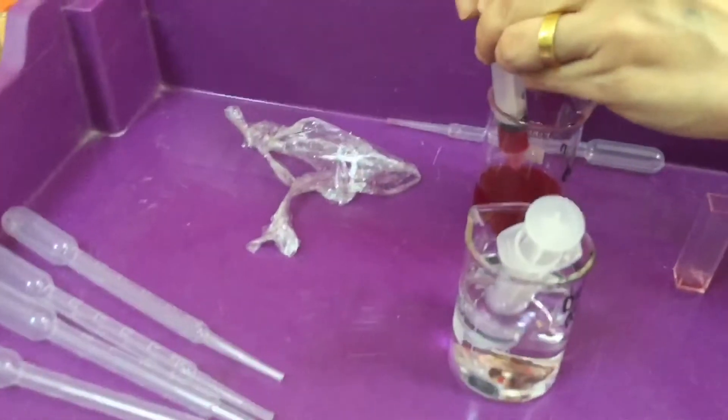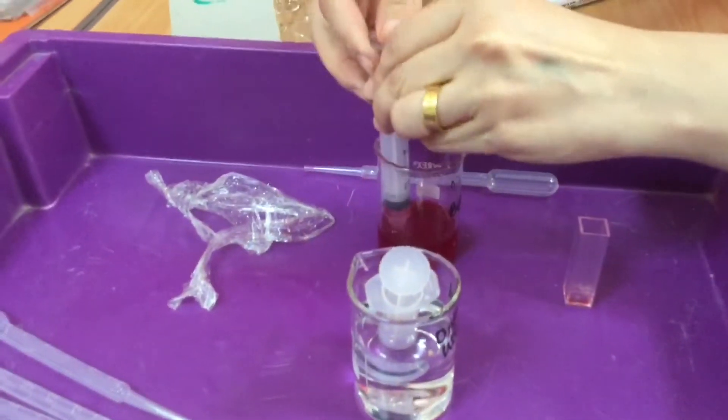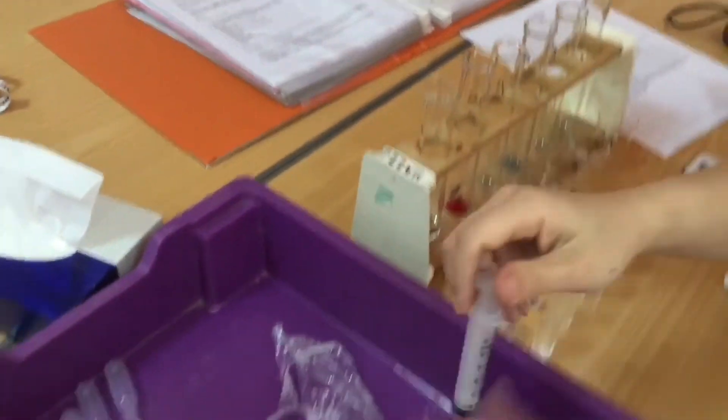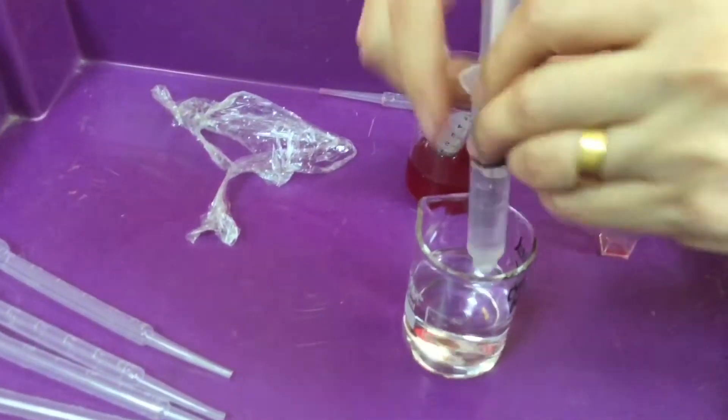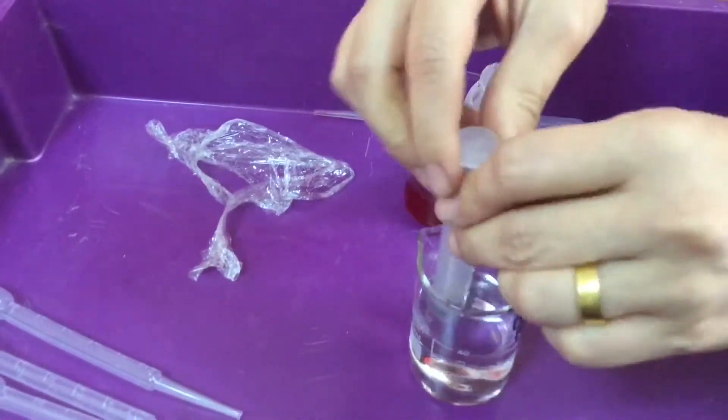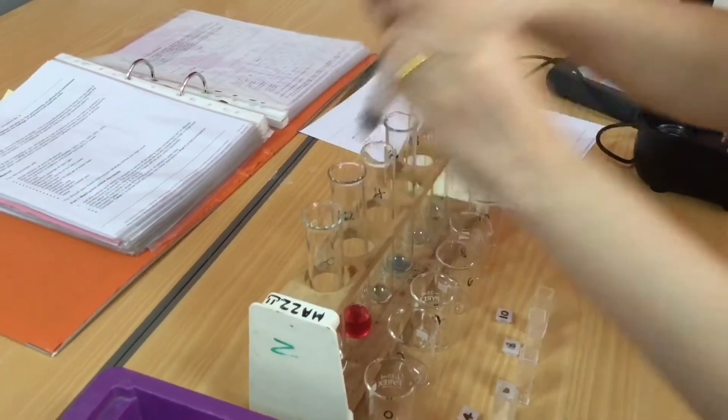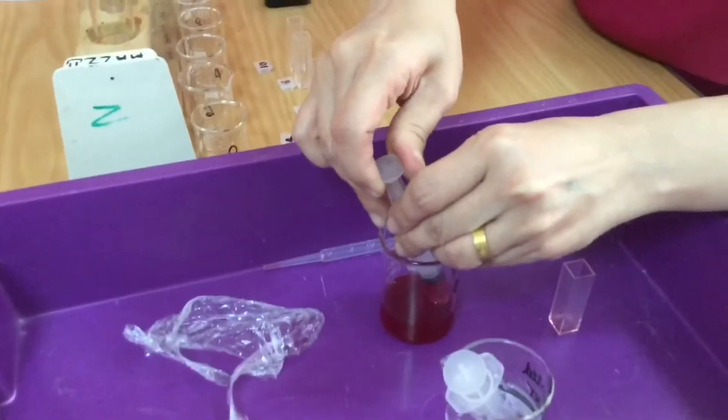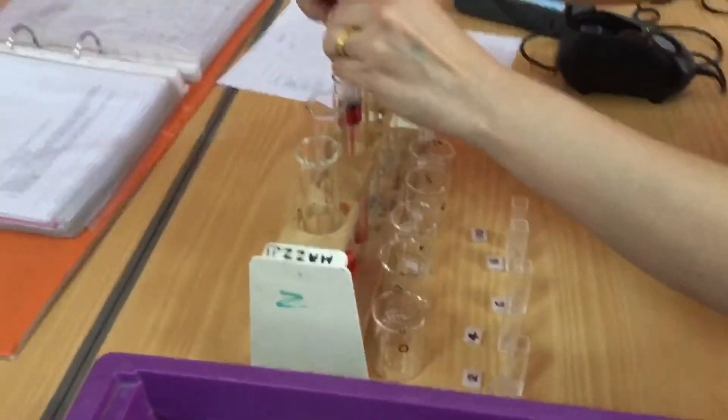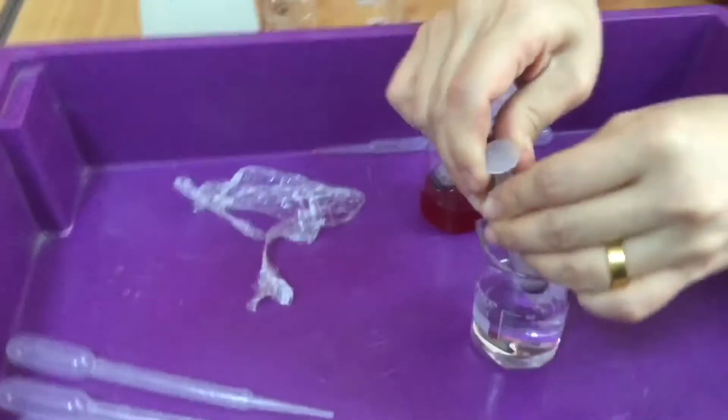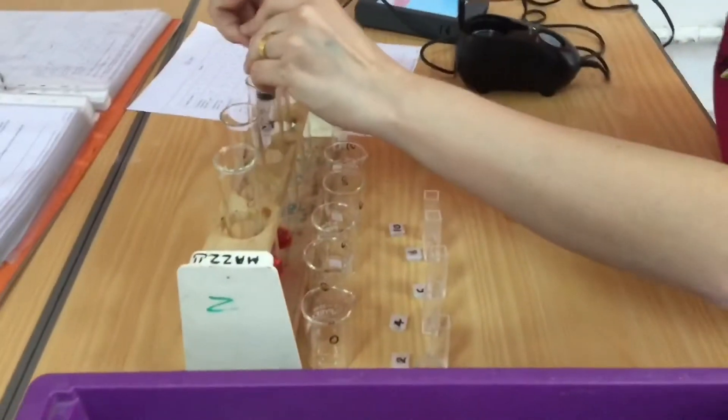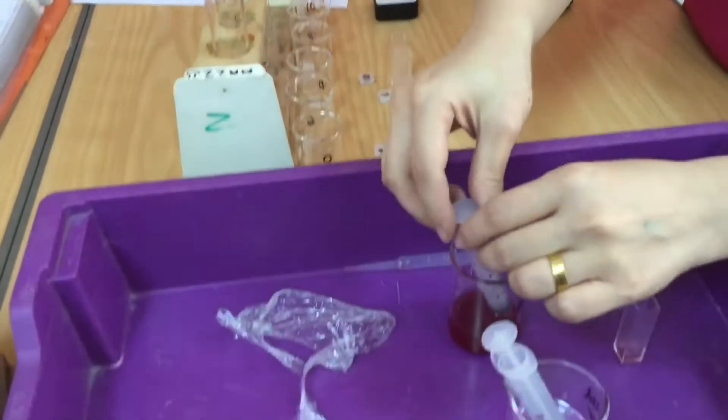In the second one I'm going to put 1ml of my stock solution, you can see there 1ml, into the second test boiling tube and then I'm going to take 4ml of my water, making sure I don't cross contaminate and I keep 1 syringe to 1 beaker. The next one I'm going to put 2ml of my beetroot stock solution extract and I'm going to put 3ml of the water.